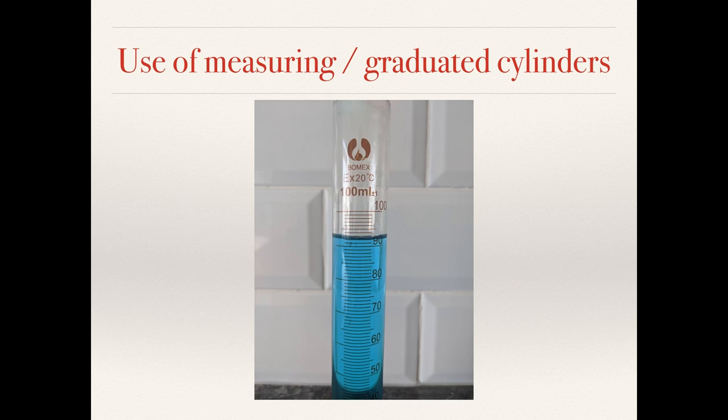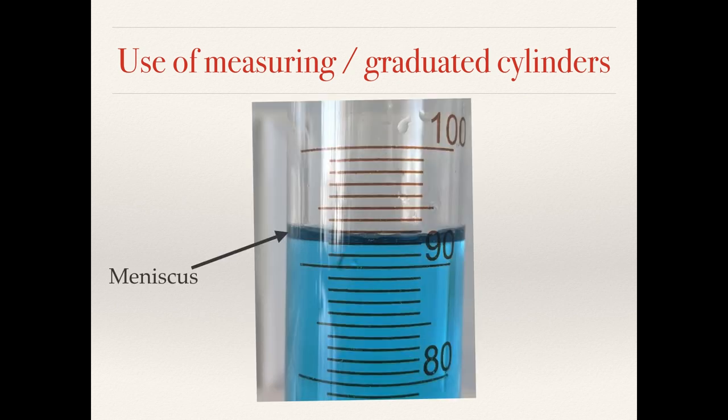The cheapest reasonably accurate way of doing this is to use measuring cylinders, but you need to know how to read these to get the best results. The cylinder here has just been filled to just over 90 millilitres. Zooming in, we can see that the water level is somewhere between 92 and 94 depending on where you're looking. The dark band above the water is called the meniscus — the top surface of the water — and you can see that it's slightly curved. The bottom of the meniscus is on the 92 millilitre marking and the top is around 93–94. So which is the correct value?